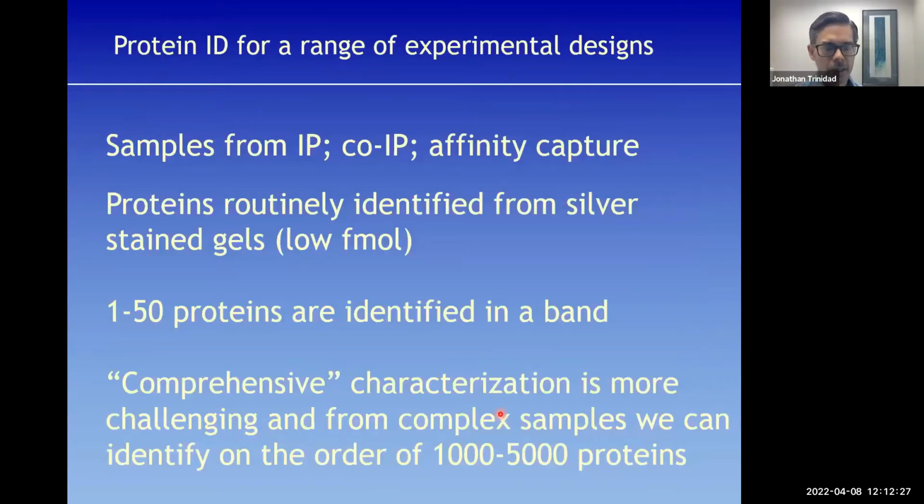All right, so most of what we do though is peptide based. For a number of experimental reasons, it's much easier and in a way more informative to determine the subunit composition of peptides. And by peptides, I mean something from, let's say, 7 to 20 amino acids in length. We can generate those from a proteolytic digest of our sample, and we can use LCMS to sequence them, and then map those back to protein structure or protein sequence.